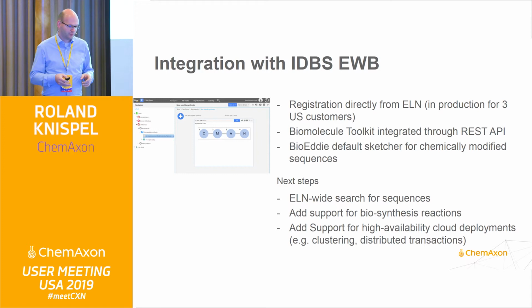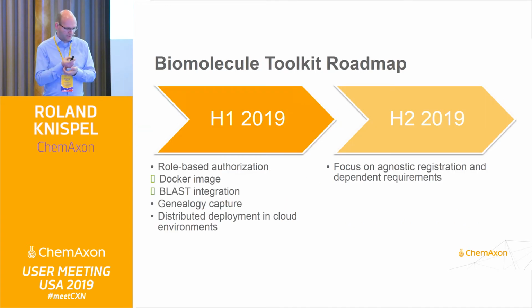And this is the current state that we're at. It covers essentially the documentation aspects and registration aspects of these modalities. And further down the road, we're now working on establishing ELN-wide search capabilities that let you distill the information that anybody has generated within your laboratories in terms of the specific context that you're interested in. This is just a brief outline of where we are going.